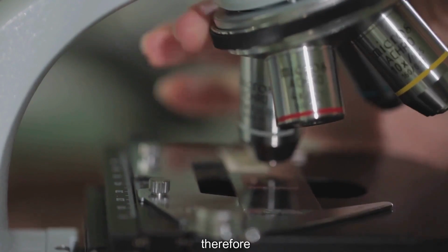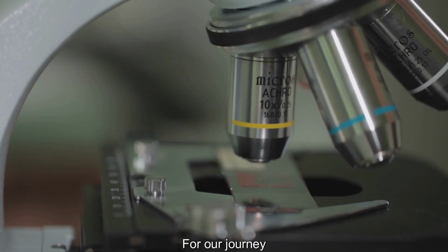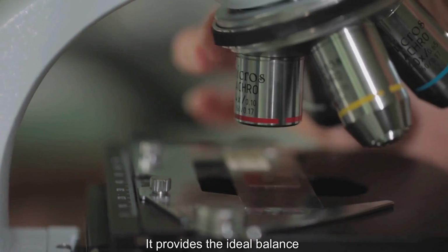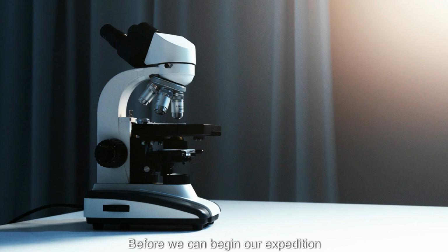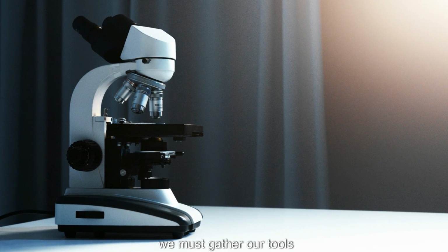Each microscope, therefore, opens a door to a different kind of world. For our journey, we will focus on the light microscope. It provides the ideal balance of power and simplicity to unlock the wonders of the hidden universe all around us. Before we can begin our expedition into the microscopic world, we must gather our tools.